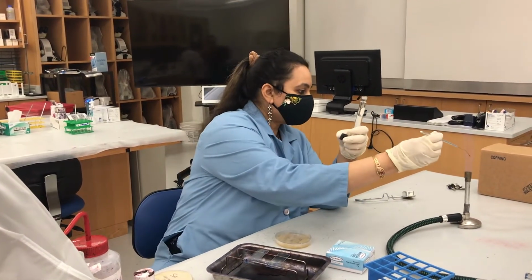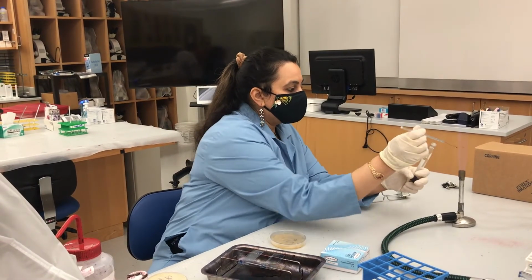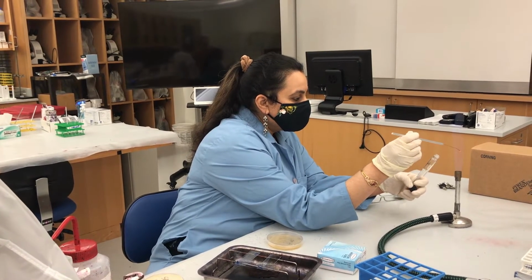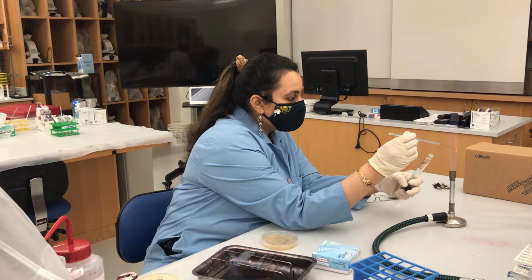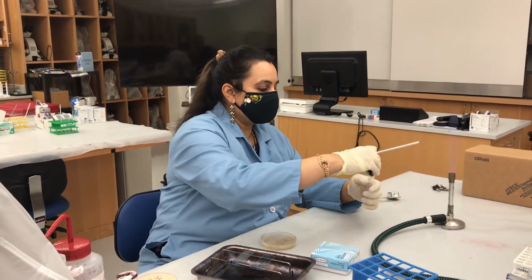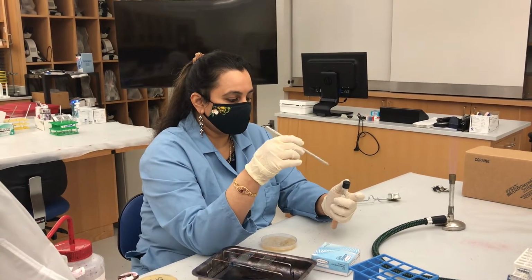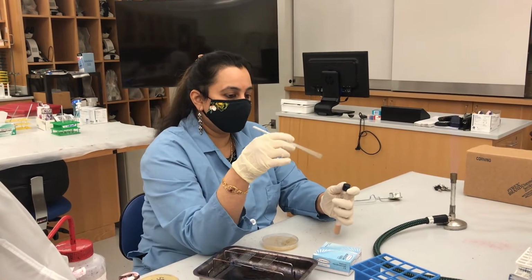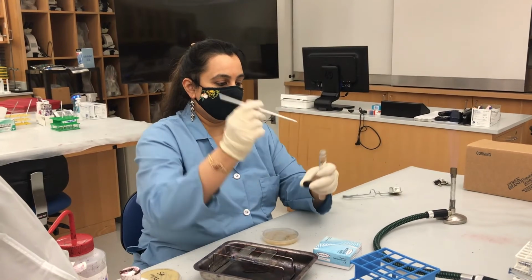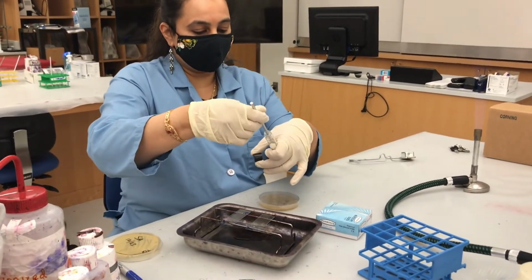and holding it near the flame so I'm not contaminating anything. By the time it comes to room temperature, letting my loop cool off a little bit. Go and grab the cells.